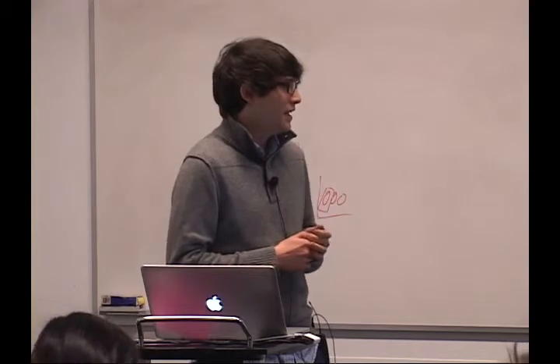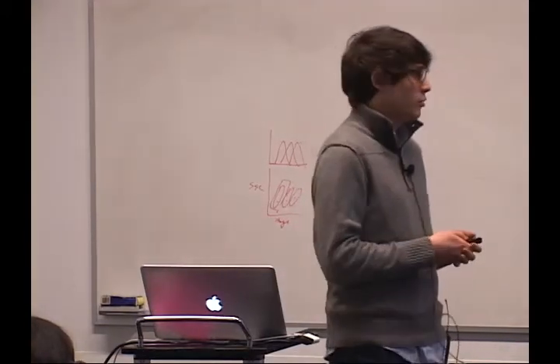And about a year and a half into our journey in playing around with the CyTOF, we met up with a computational biologist slash electrical engineer in the radiology department at Stanford, Peng Chu, who was working on an algorithm to look at high-dimensional data sets. And with the help of a statistician in our lab, Karen Sachs, they kind of transformed this algorithm into something that we could use to look at high-dimensional flow cytometry data in a more intuitive way.